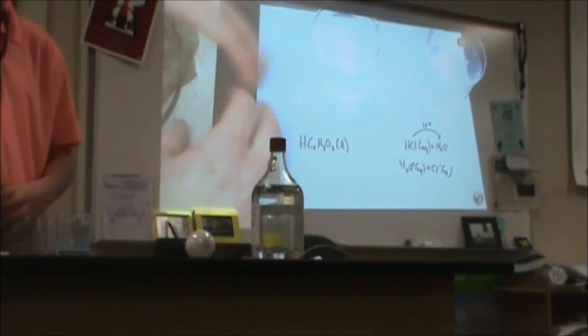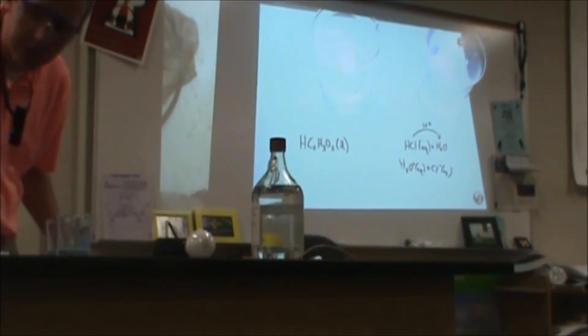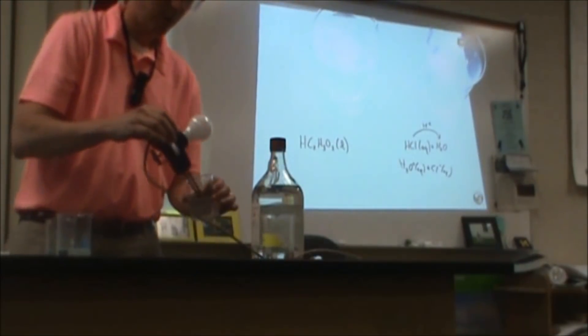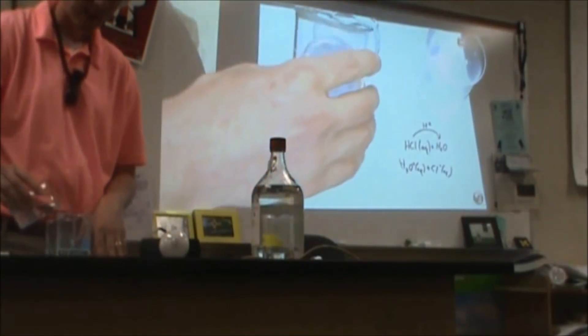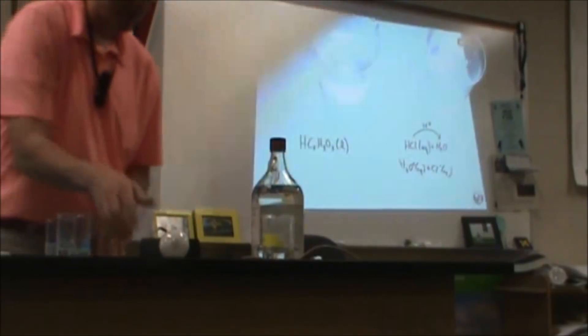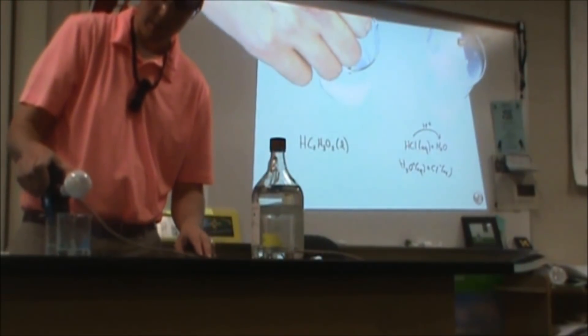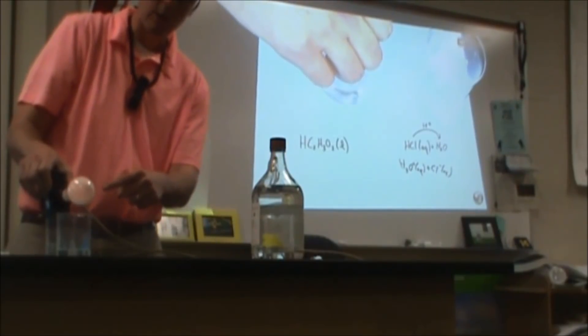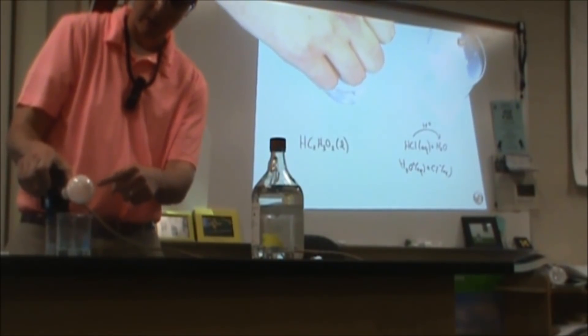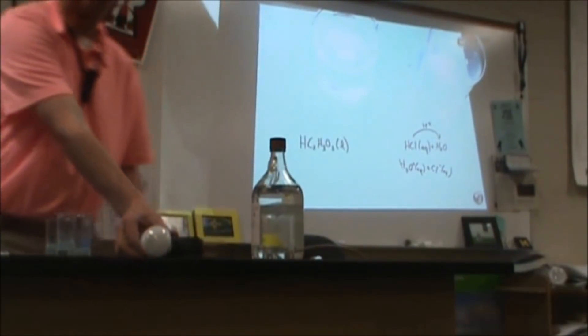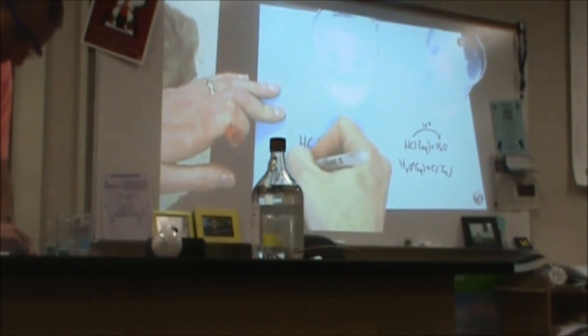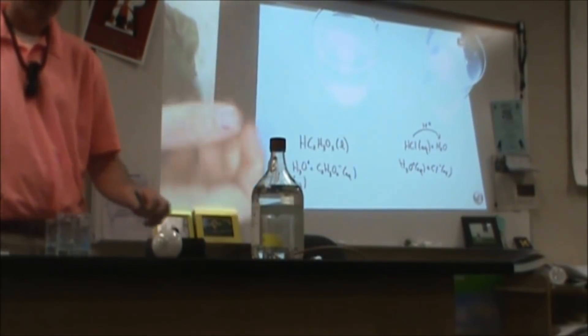This is a weak acid if I give it something to give an H+ to. I'm going to take my sugar water from over here, which does not conduct electricity. And then I have my glacial acetic acid over here that does not conduct electricity. Yet, when I mix them, some of those water molecules will get ions from them. You'll see a very faint glow. Not much for this light bulb. High resistance here. But you see a little bit of conduction of electricity. This is a weak electrolyte. Some of those acid molecules here are turning into H3O+ and acetate ions. But not a lot. I see a really small amount of conduction.